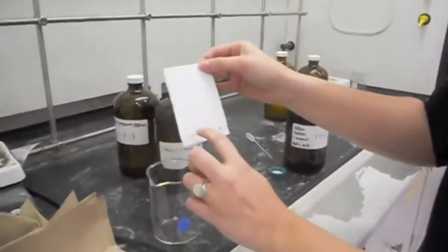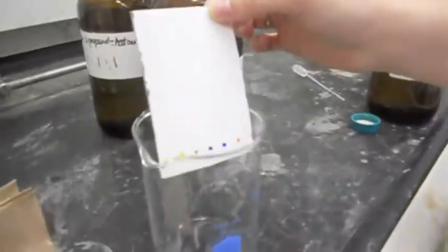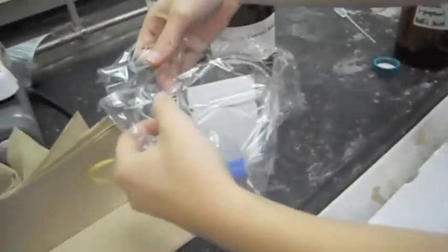Make sure the solvent does not go above your 1 centimeter line you've put on the inks. You're going to place it slowly into the beaker, sideways, where it does not bend. Watch as the solvent travels up, but before that you need to get the plastic wrap over your beaker.